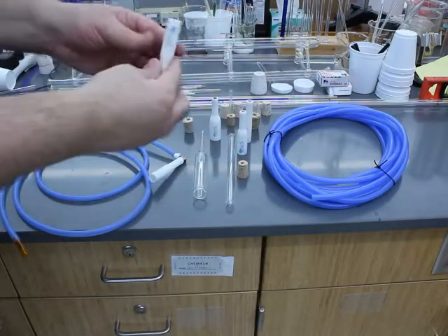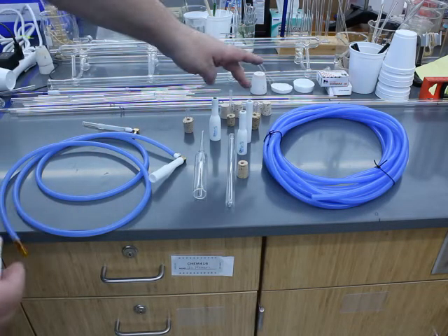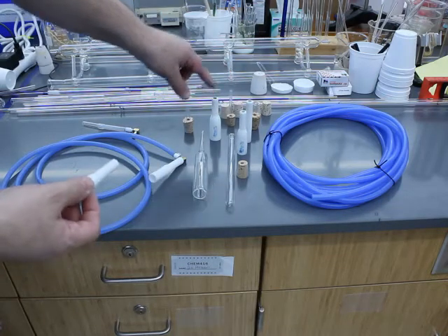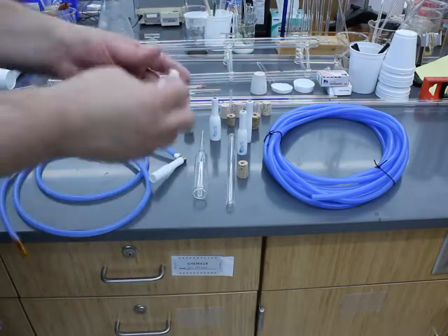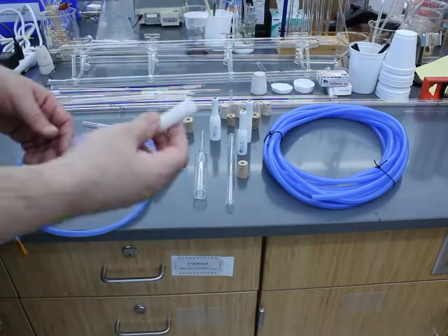What I'm holding here is a silicone adapter. I believe this is 14 millimeter. It goes from 10 to 14. I think this is 20 and this is about 24, 25 millimeters. These are incredibly useful.